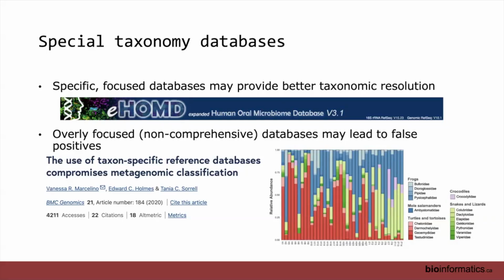And it was just demonstrating that if the only thing you have in a database is something ridiculous that wouldn't necessarily exist there, you're probably still going to find it with the sequencing methods because it's the only thing you're looking for. And you can find some sequence similarity between a lot of different things. But if you actually had things that match much better within your database, then you'll find that. There is much less of an issue with something like amplicon data than there is with metagenomics, but it's still worth keeping in mind that if the only thing you're allowing yourself to find in a sample is not likely to be there, you may still be identifying it, but that doesn't mean that it's correct.